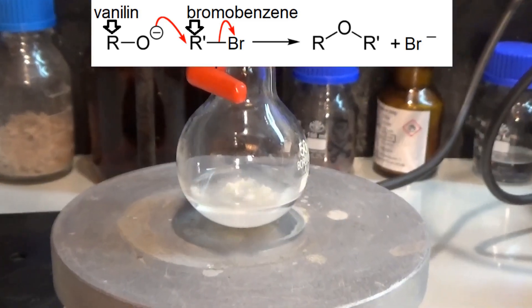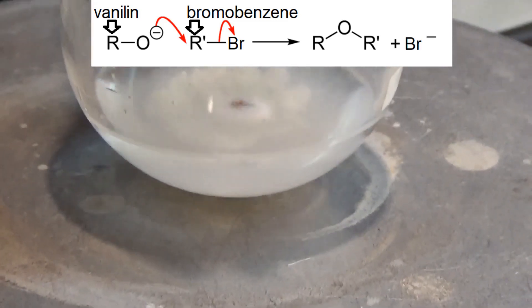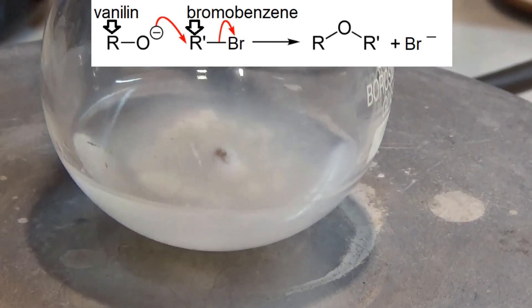So now we are ready to stopper the flask and start stirring. The reaction mixture is stirred for three hours to ensure that we have a good yield.